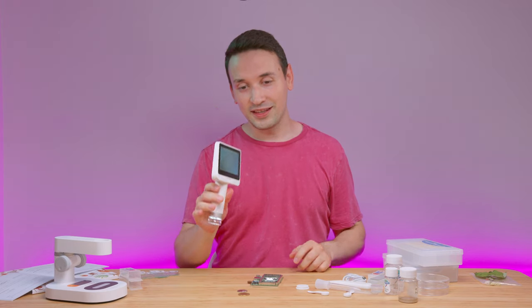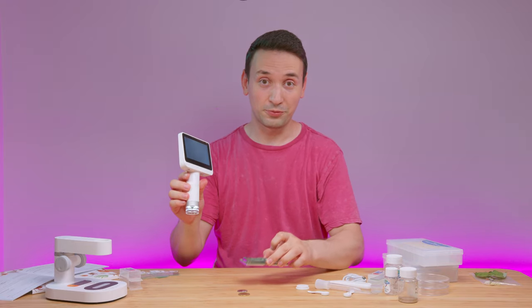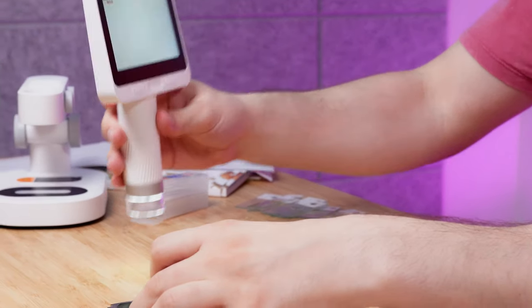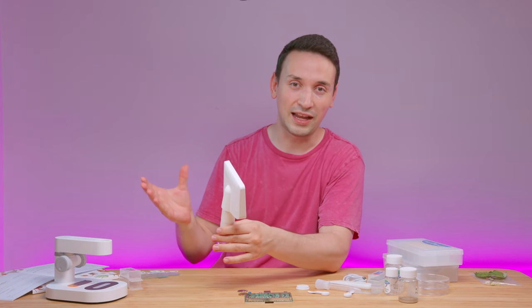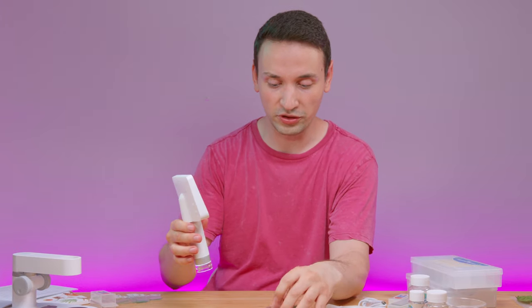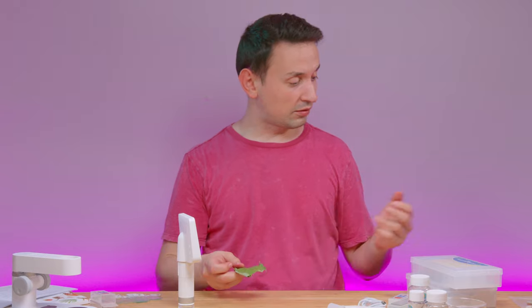Another way I think I'm going to use this is for looking at a PCB or soldering. I could set it up, then use my phone or a tablet to live-view what I want to solder — that would be a great use case for this.